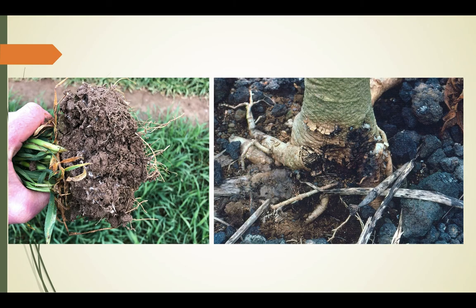So let's take a look at some pictures. Here we can see mycorrhizal fungi, the white ones. These are the mycorrhizal fungi. They increase the surface area of the root for better absorption. Then here is a representative example of a soil fungus affecting living tissue of a plant, leading eventually to the death of the living material of the plant.